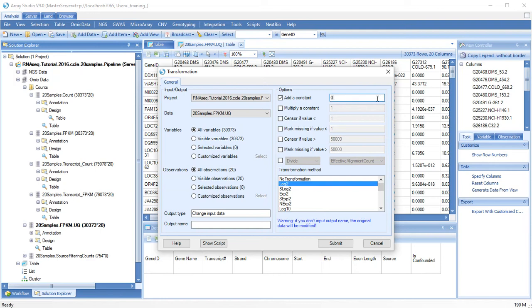We should add a small constant so that we don't log2 transform 0, and name a new output object.